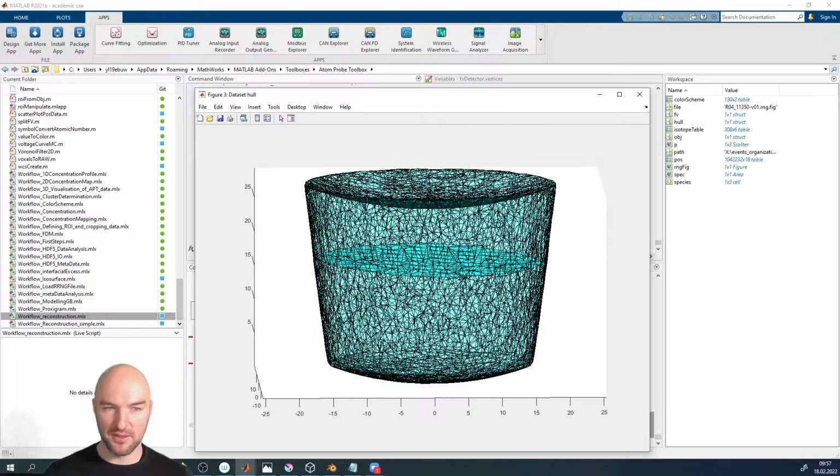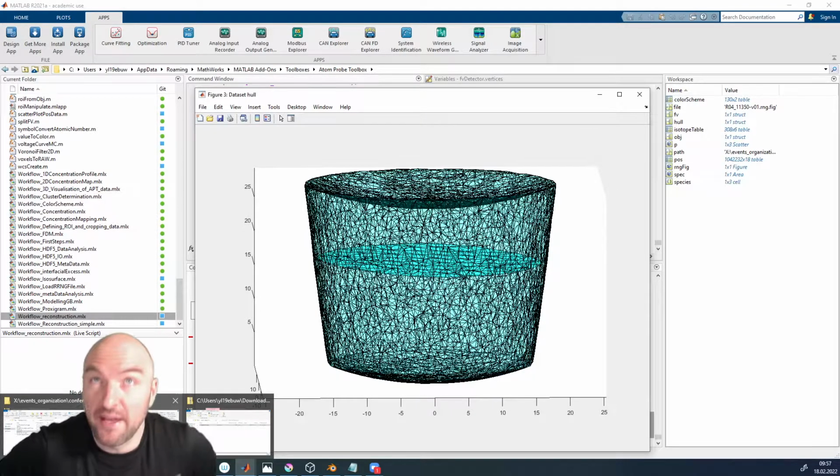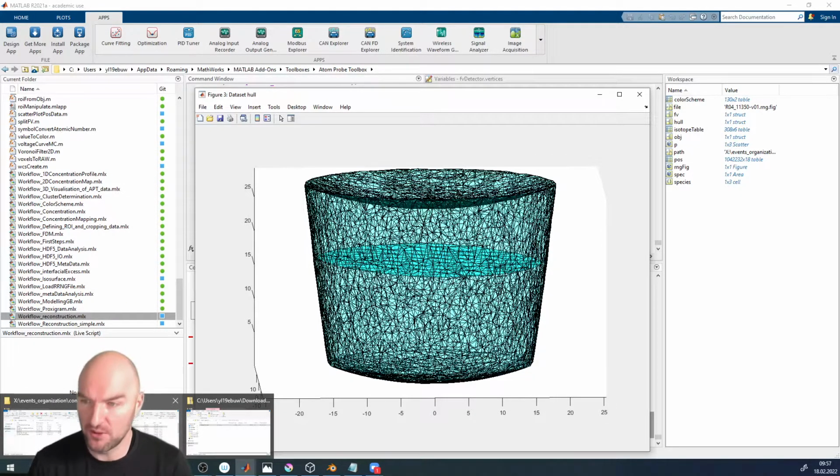And the algorithm for that I've published a while ago. Well, there's a couple of ways you can do that. And we have actually published an algorithm that is based on ray tracing 2-3 years ago together with computer graphics people here in Erlangen. But unfortunately, I don't have a distributable version of that algorithm.